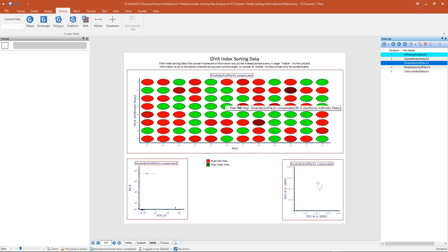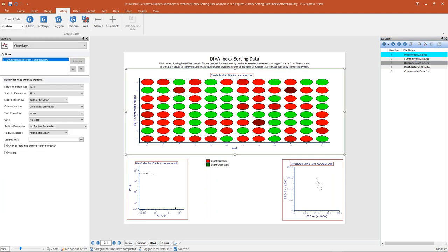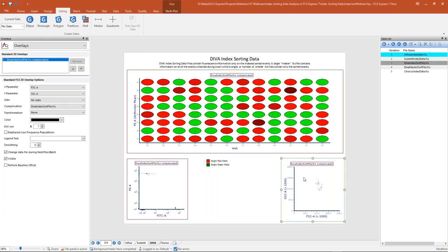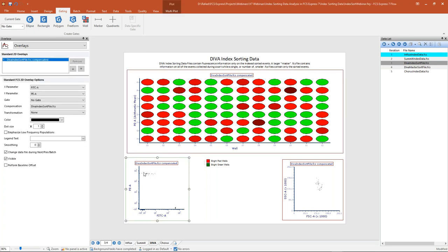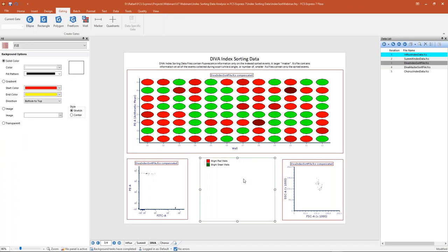On this page we have set up our plate heat map, a single plate heat map and our two color dot plots below. On the heat map we have our index sorted files, and we've sorted 96 cells into the wells of a 96-well plate. The dot plots below show just those 96 cells. We have our gate view in the center, and we're going to delete the previous gates from our analysis so we can start working with our DIVA data.